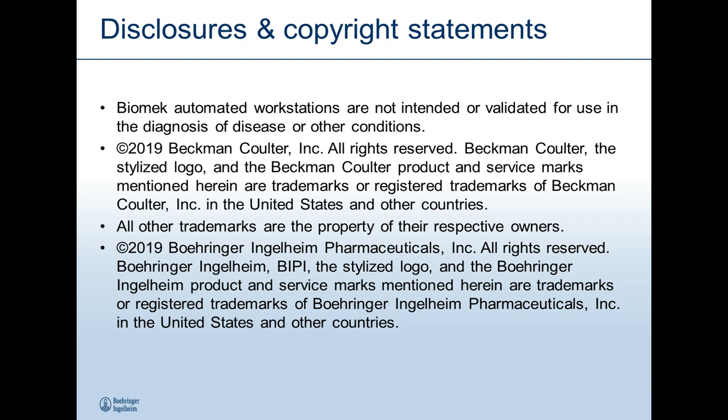How do you access and visualize data from your automated assays? Well, there's a couple of things that come into consideration with that. Personally, the software that we use here at BI in my lab is primarily GraphPad Prism and Spotfire for doing data visualizations. Accessing them is where you can run into some problems sometimes.